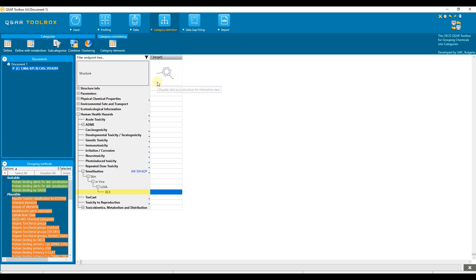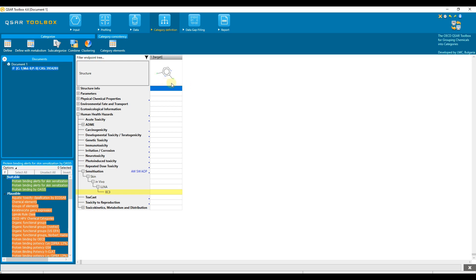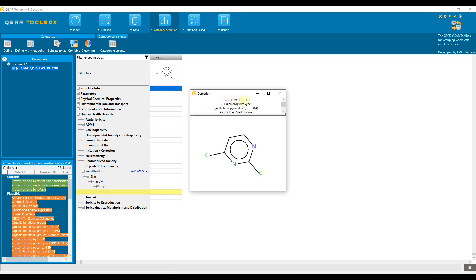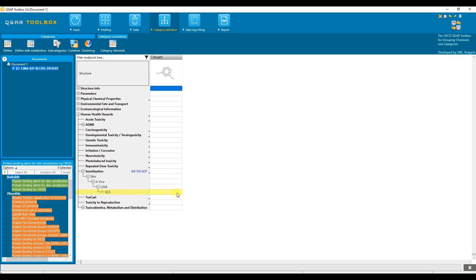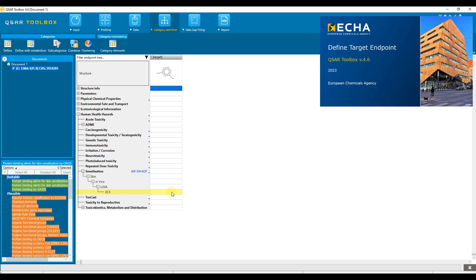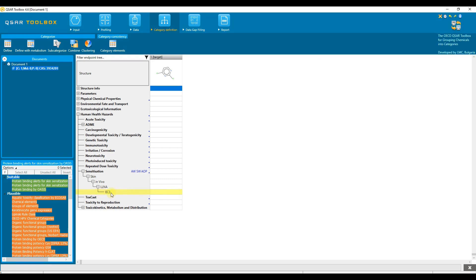How to define a category is going to be demonstrated in this video tutorial. The target chemical has the identification number 3934-20-1. In this example, the target endpoint has already been defined. Please refer to the corresponding tutorial if you want to learn more about the definition of the target endpoint in the QSAR Toolbox. Note that the same functionalities are available when the target endpoint is not defined. The only difference is that relevant profilers and databases will not be highlighted or sorted according to the target endpoint.